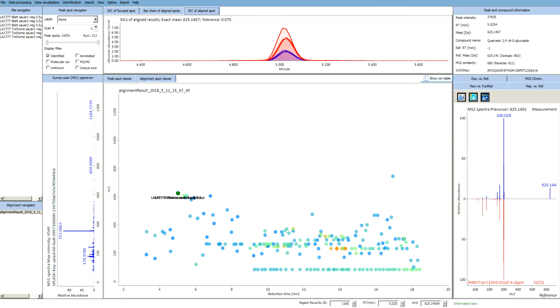If you're somewhat unhappy with the current parameter settings, for instance due to too high a threshold for the peak picking or too low a percentage of similarity to the library spectra, you can always change, modify and optimize these settings by going to the data processing tab and selecting either all processing, identification, or the alignment phase.